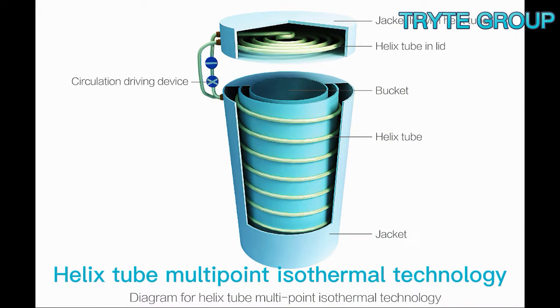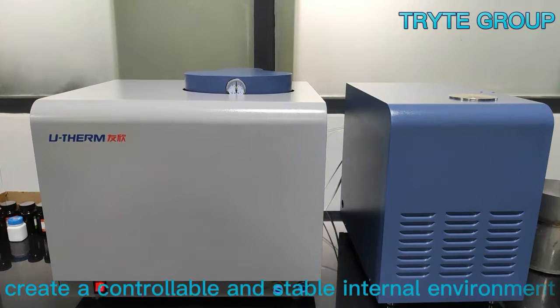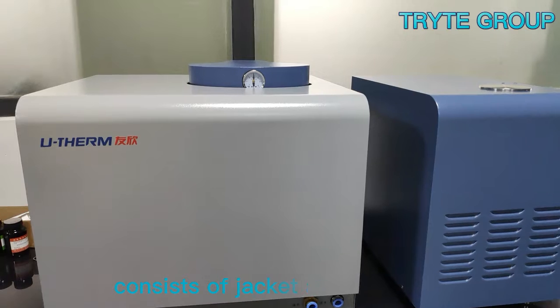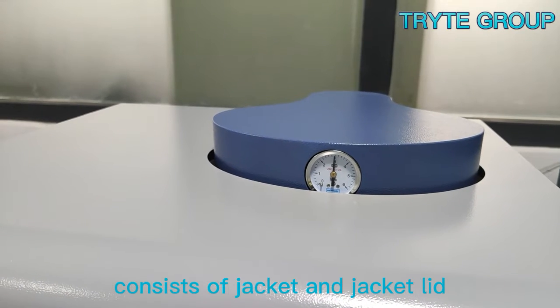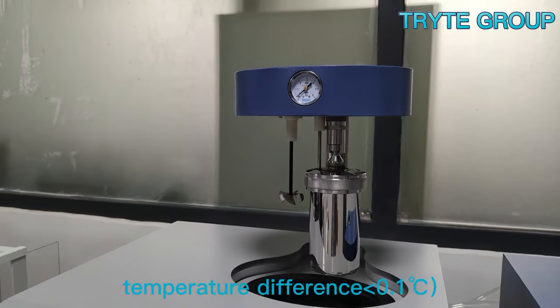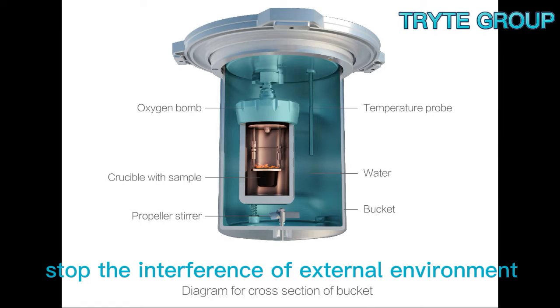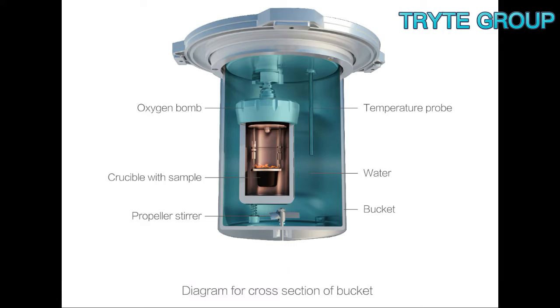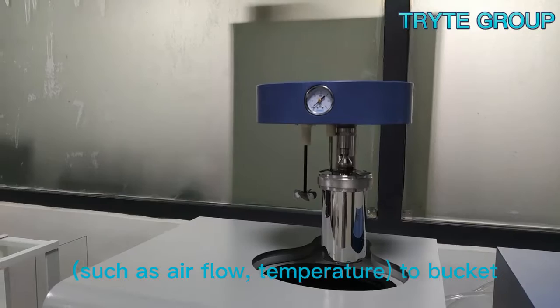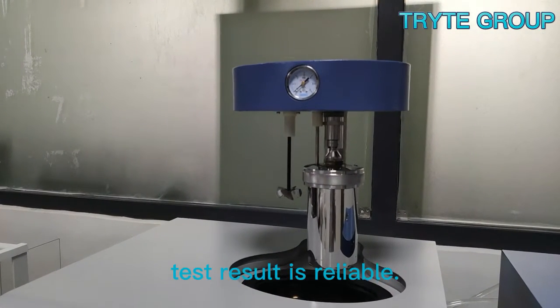Using multipoint isothermal technology, it creates a controllably and stably internal environment. It consists of a jacket and a jacket lid, with a temperature difference less than 0.1 degrees, stopping interference from the external environment such as air flow and temperature fluctuations. The test result is reliable.